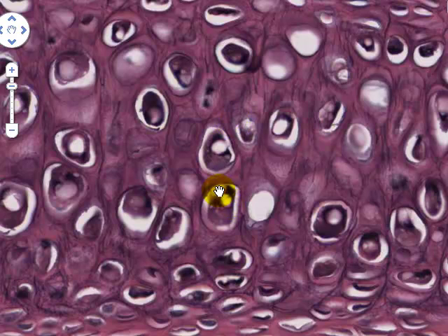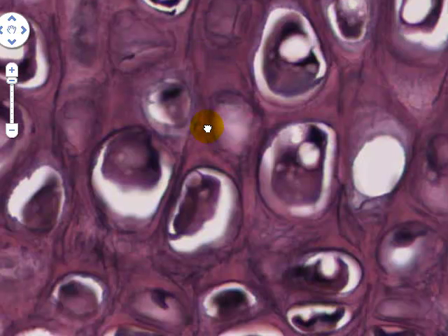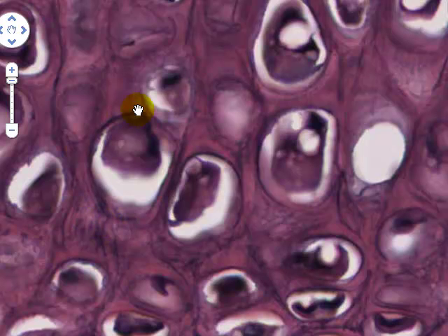So to recollect again, these are shrunken back cells contained within their lacunae. The pink reddish material you see in the background is the hyaline cartilage itself, made up principally, the fiber component is of collagen type 2. And then as we go to maximum magnification, you can see here that small dense dark staining fibers are elastic fibers, which are interspersed in and among the cartilage matrix and around the edges of the lacunae which contain the chondrocytes.